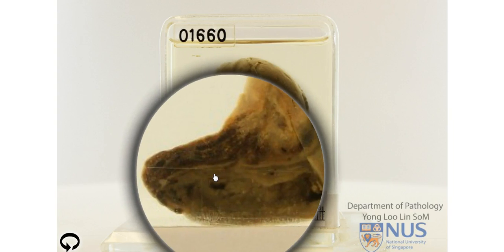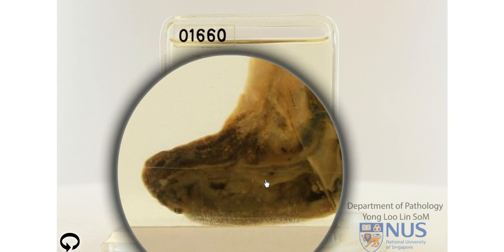Let's take a closer look. Within the lumen, instead of seeing a very nice clean luminal surface, we are seeing a coating with yellowish — in the fresh specimen it would appear yellowish-green — material. This is also purulent material which would be full of neutrophils, necrotic cellular debris, and sometimes even bacterial organisms.